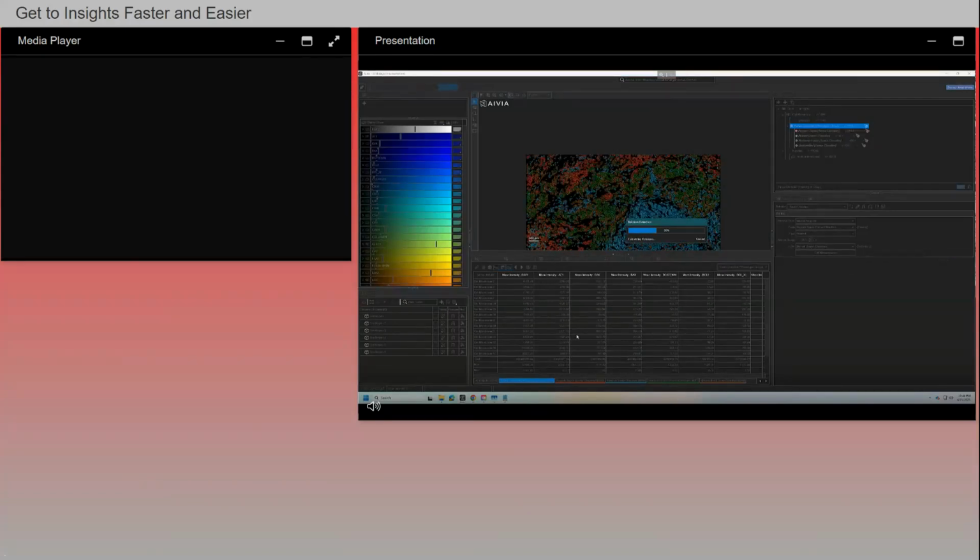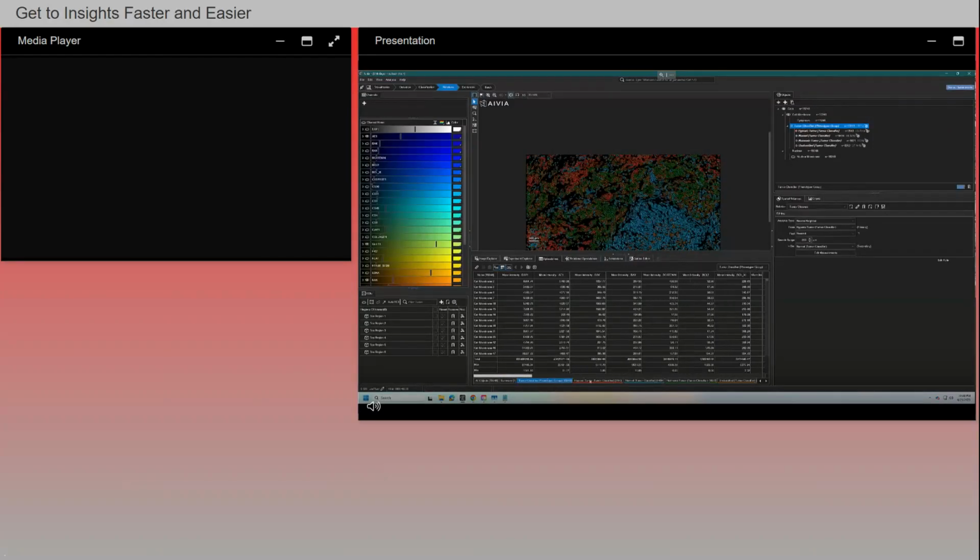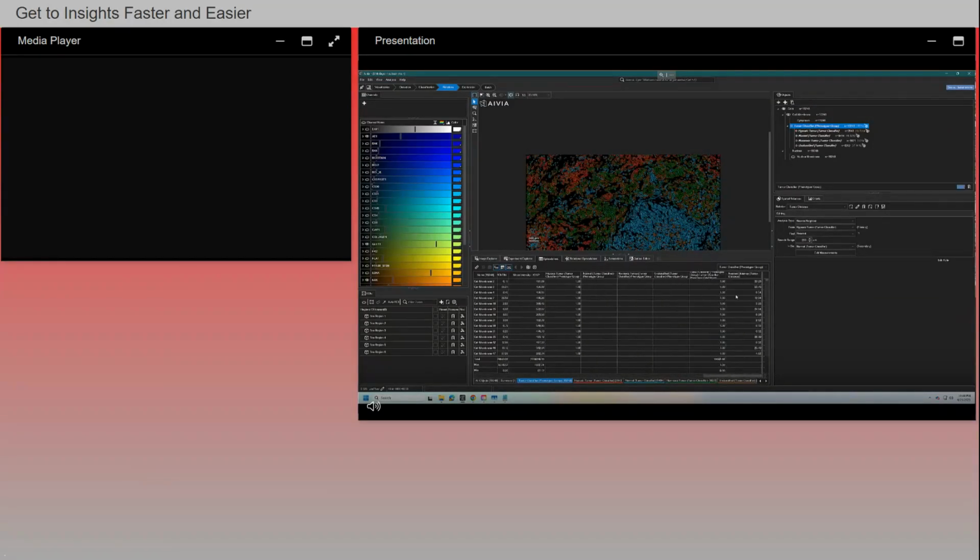So when I run this analysis, which is pretty fast, we're doing vertex to vertex distance measurement, and it goes rather quickly. So here we are going to see the nearest distance measurement is already calculated for all the membranes that are in the particular hypoxic tumor category, which is 2,643. Here we can have some interesting visualization options.